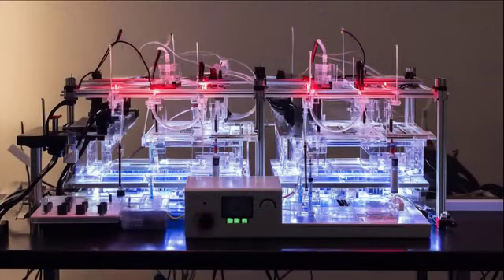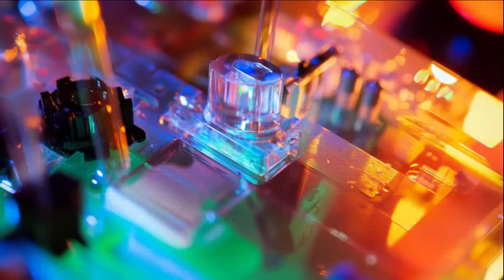Droplet merging and splitting in Lab-on-a-Chip devices allow for controlled reagent addition and sample division. For example, two droplets can be precisely merged to initiate a reaction or split into smaller volumes for parallel testing, much like mixing ingredients in a recipe or dividing a large cake into equal slices for uniform servings.